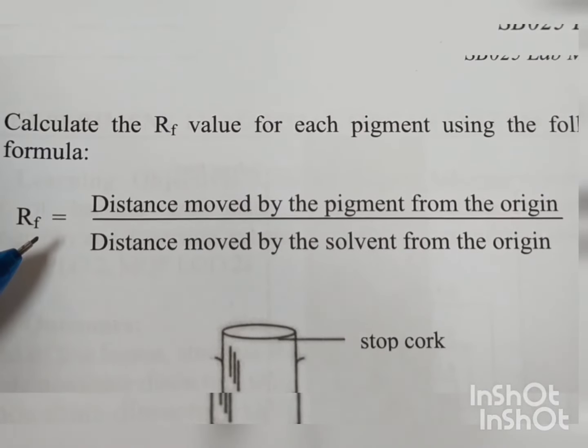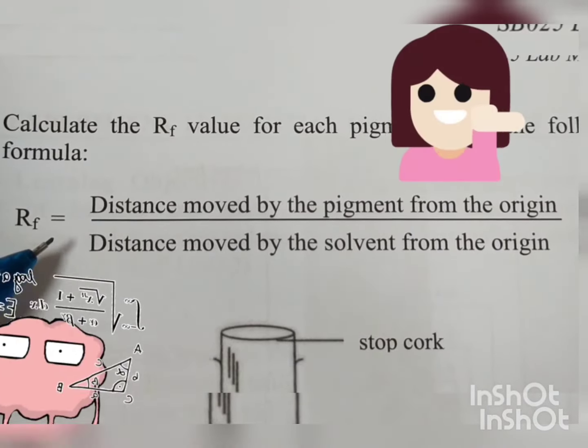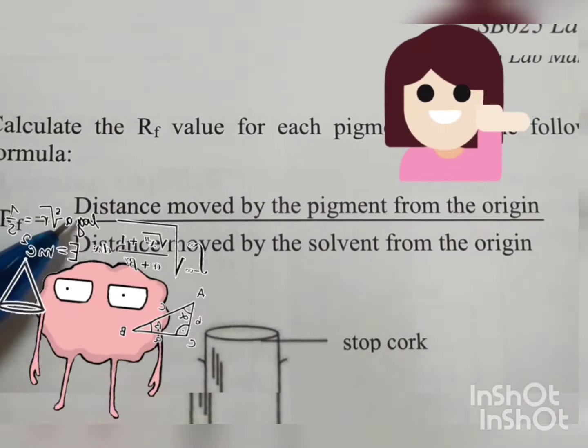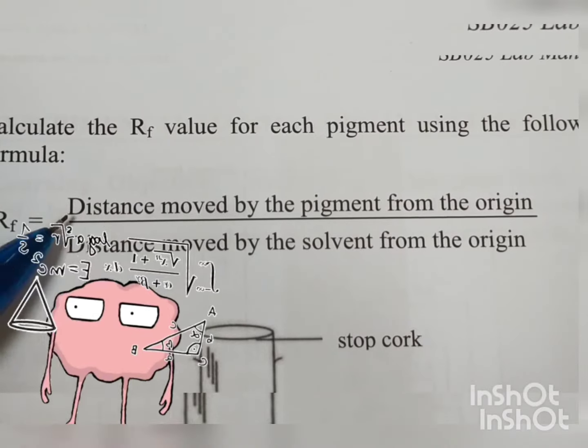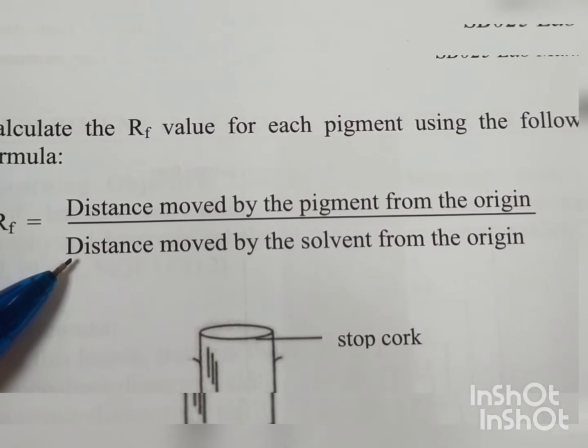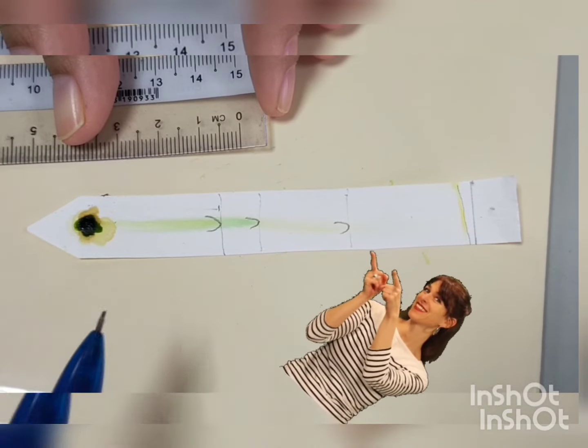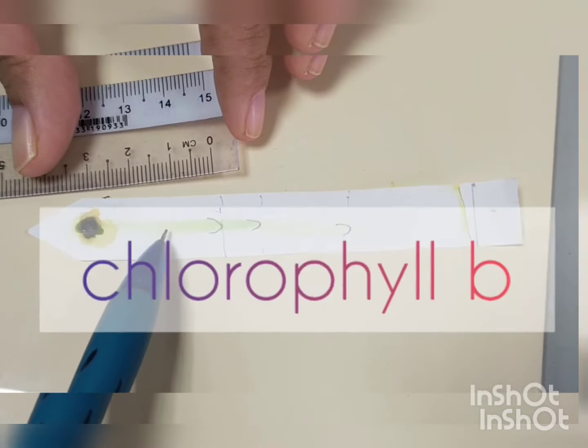Next, calculate the RF value for each pigment using the following formula. RF is equal to distance moved by the pigment from the origin over distance moved by the solvent from the origin. To demonstrate the RF value calculation, we are going to use chlorophyll B as an example.